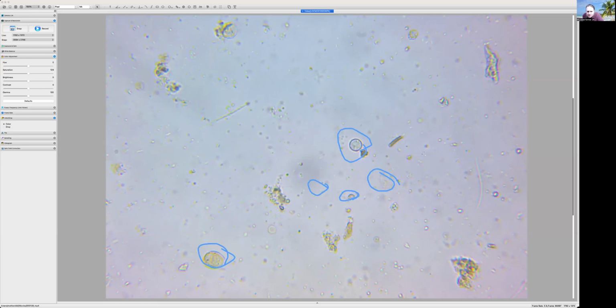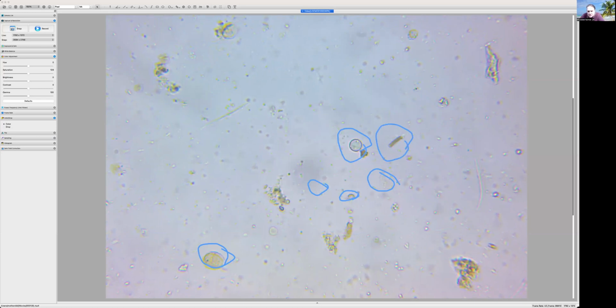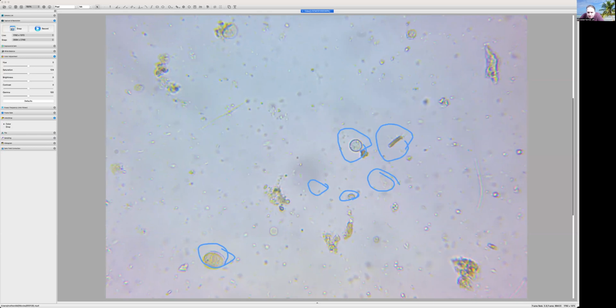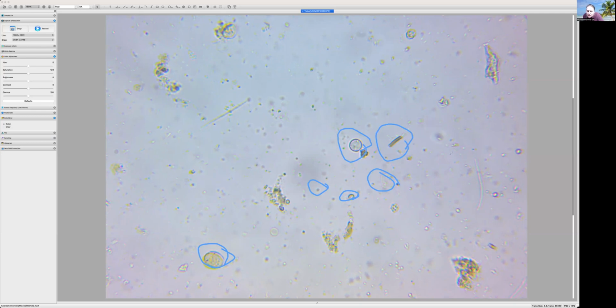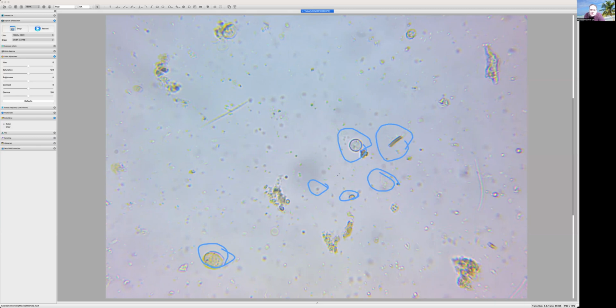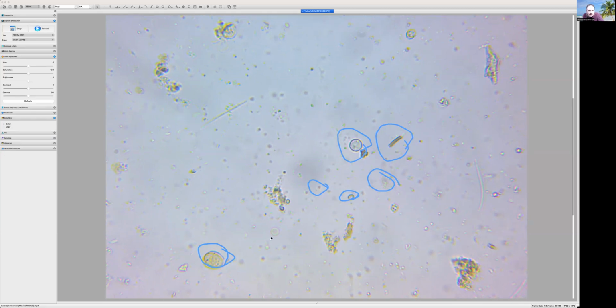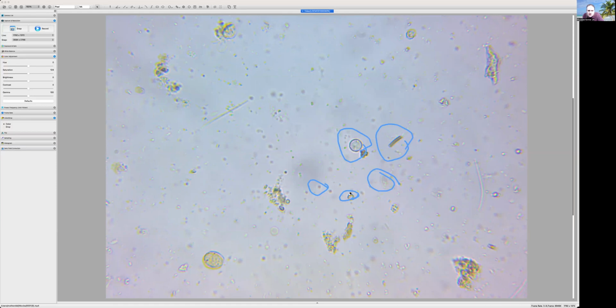This is possible, very, very small fragment. Here comes a flagellate right up through here too. It's a fragment of a beneficial fungi. It's got the different color. It's got nice, sharp, broke off edges, but can't say for sure because it's broke too short. No septa. Okay, well, you can definitely see this baby is loaded.